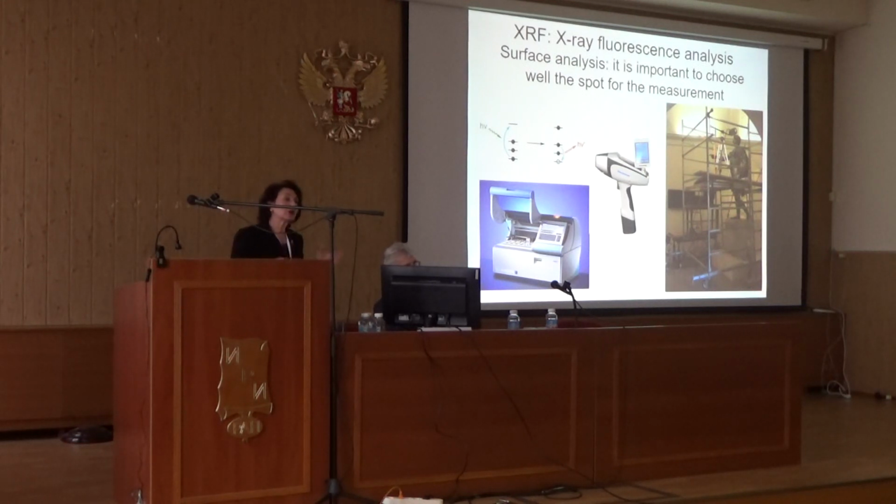What is important is that we have to choose very well the different spots we are analyzing. With this statue, it was easy because it was found broken, and there were many places, many spots where the patina was missing. So I could go down to the metal.